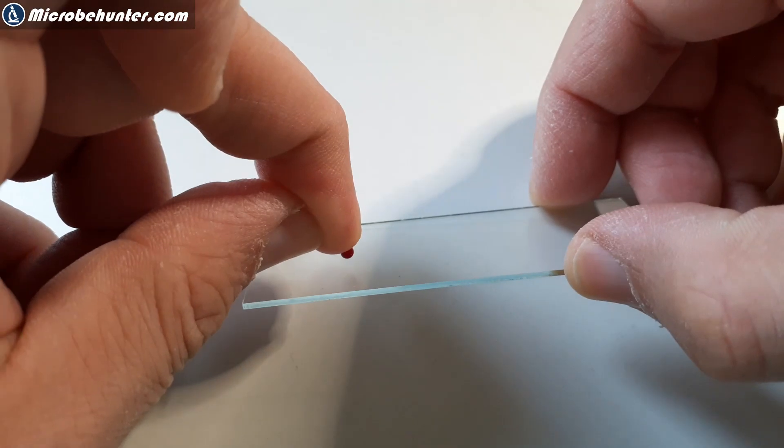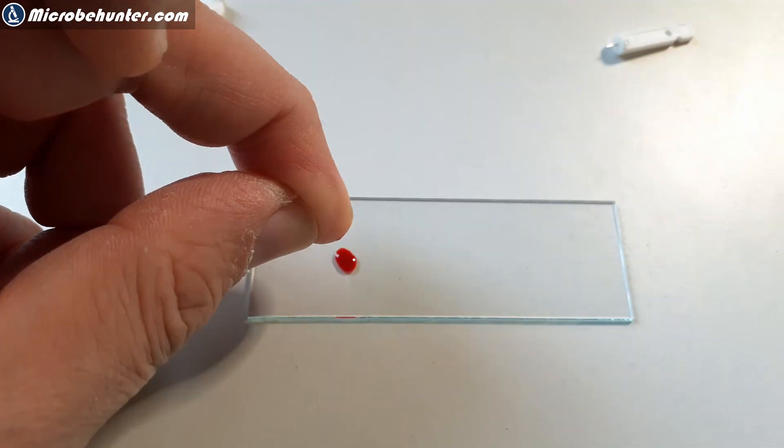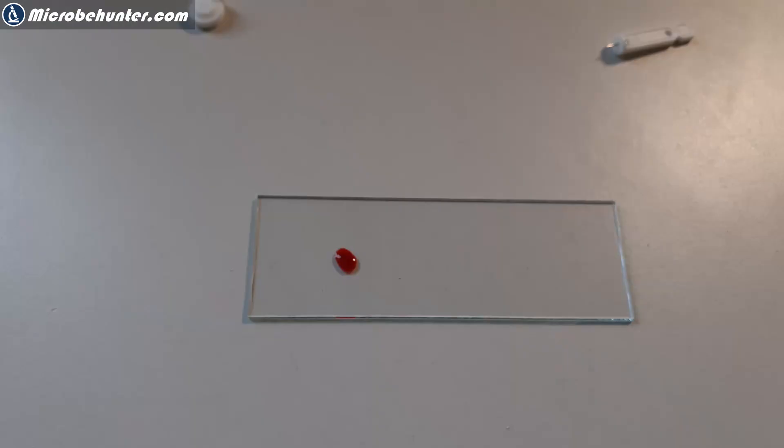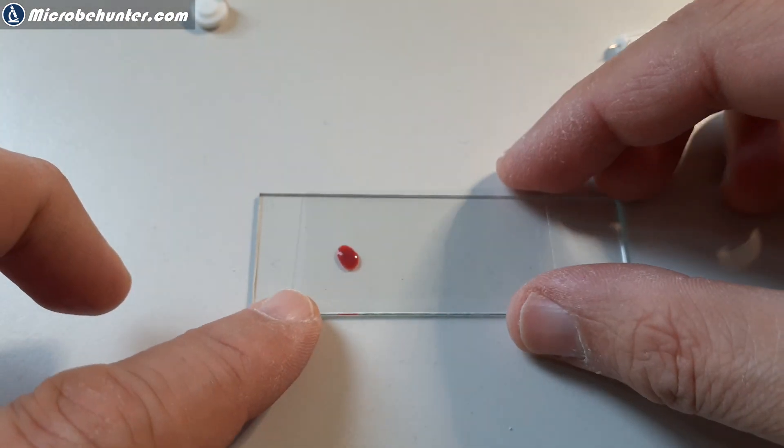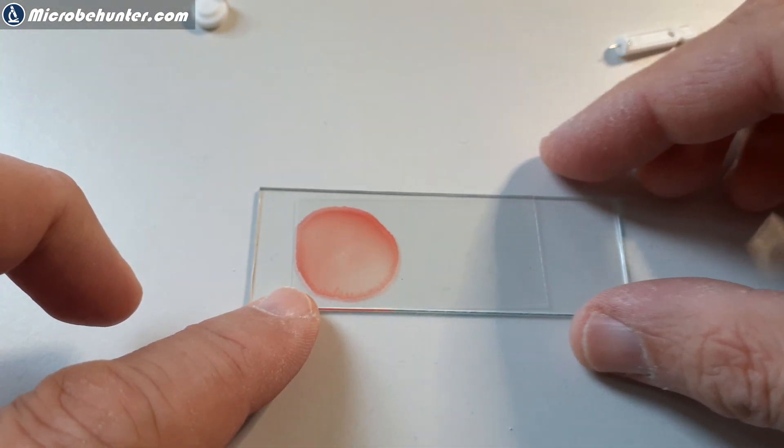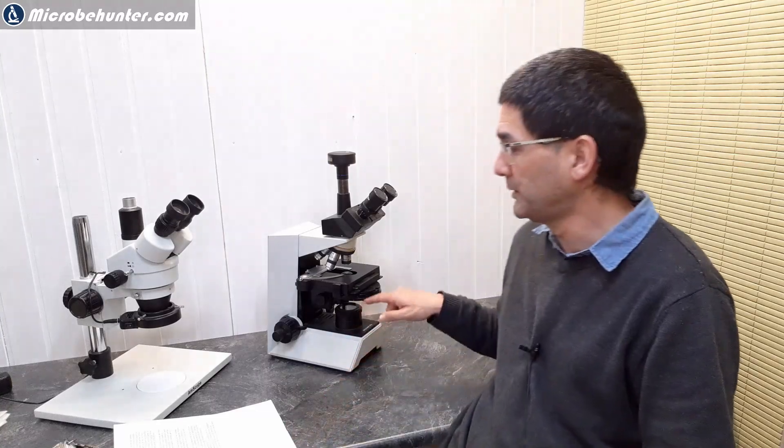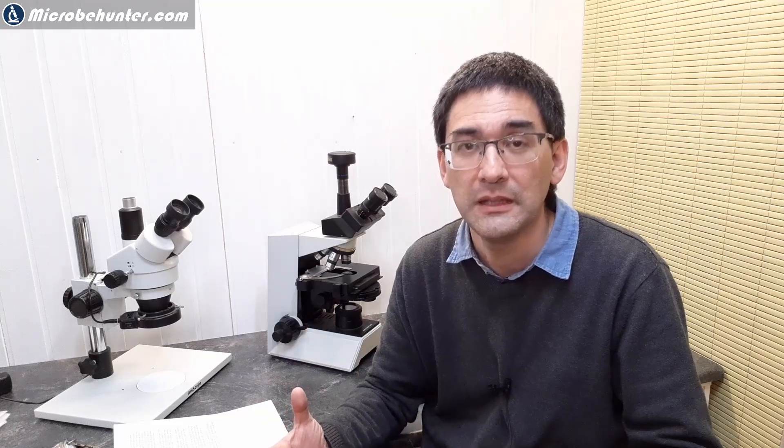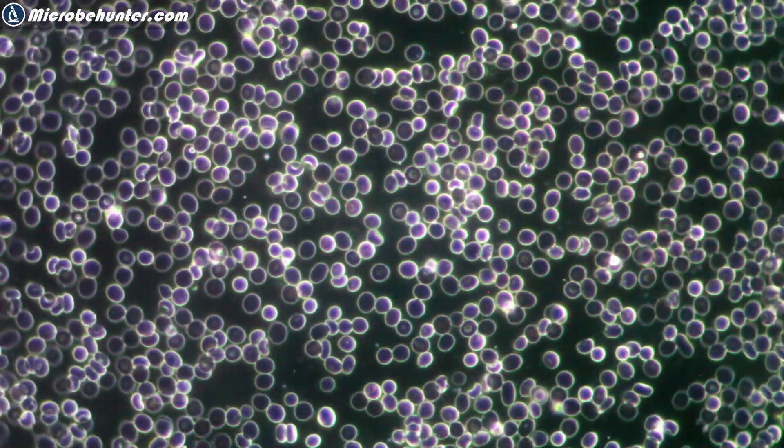Some basic background. Of course it's possible to take a little bit of blood and put it under the microscope, and when you do that you're able to see both the red and the white blood cells. If you have a dark field microscope, and you can do that by inserting a dark field patch stop in the stage or maybe you have a dark field condenser, then you're able to see those red blood cells as bright circles on a dark background.